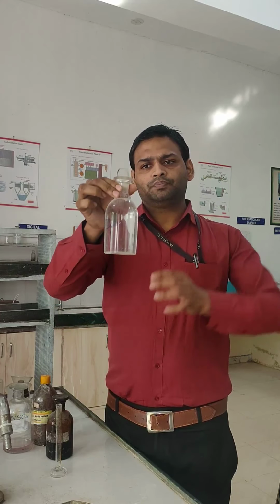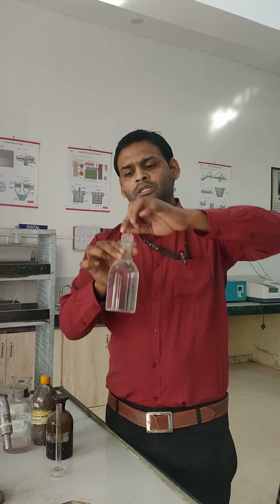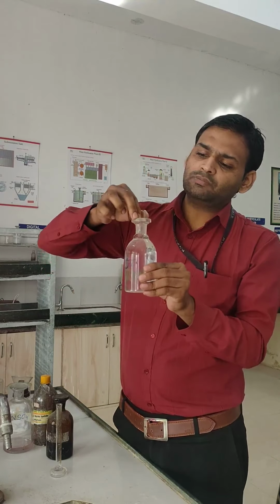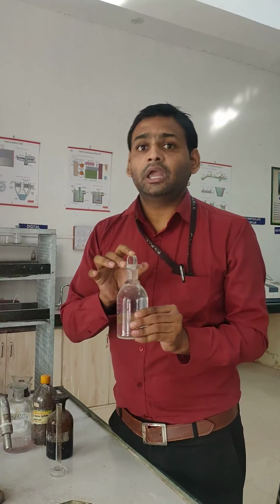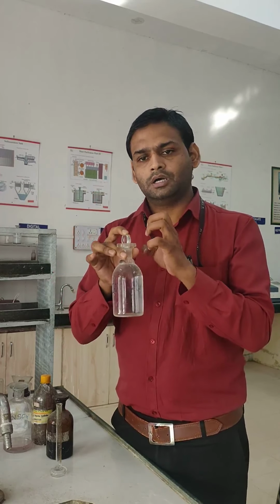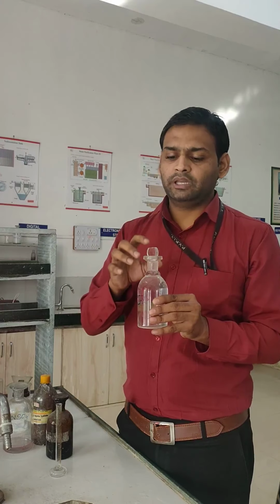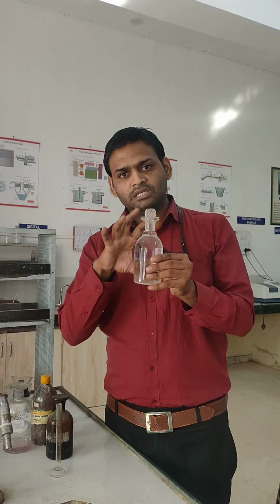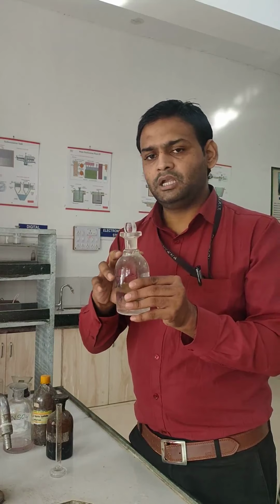We use this bottle for water sampling, and it is a special bottle because a cap is provided, to avoid atmospheric gas contamination after filling it with water.